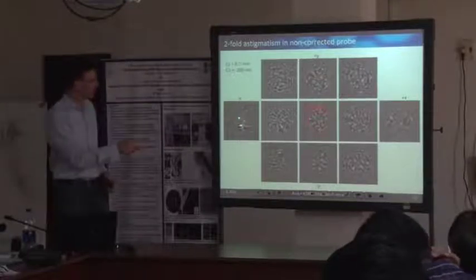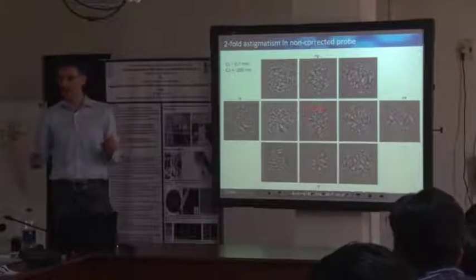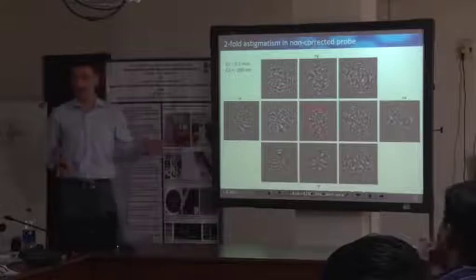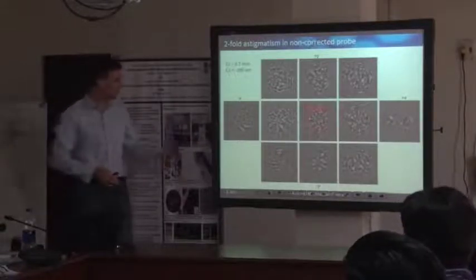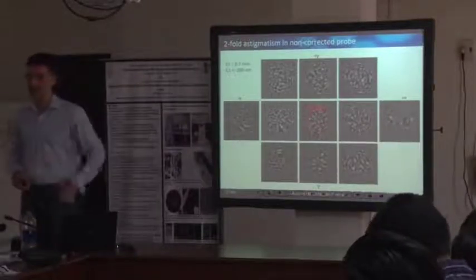You can just use that, you will see that the streaking changes by changing the stigmators of your microscope. And here you have to use the condenser stigmator, because it's the illumination system of your tool. It's not the objective stigmator in this particular case.